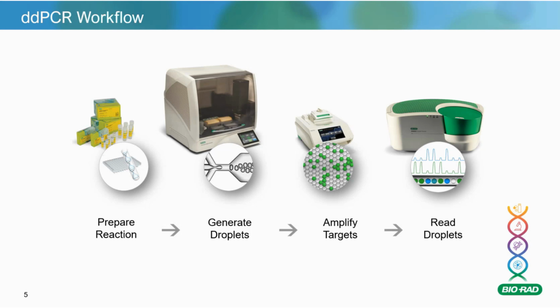So really, the big 2 points in any digital PCR workflow are, 1, what is the partitioning method? And 2, how are they reading their samples? Are they reading it in one giant picture, or are they reading it individually as a single partition each? And in the case of the Bio-Rad system, we're reading it one at a time, like a flow cytometer.